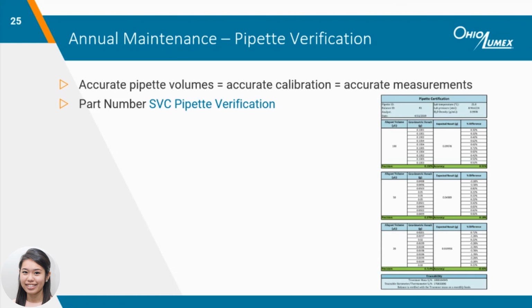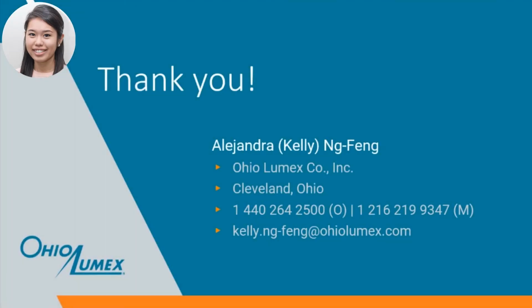During the pipette verification, we go through an extensive check to ensure the pipette volumes are within specifications or perform a linear offset if necessary.